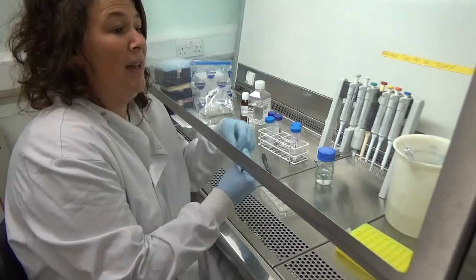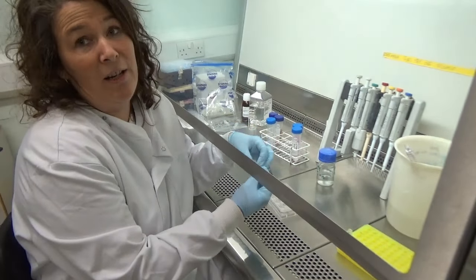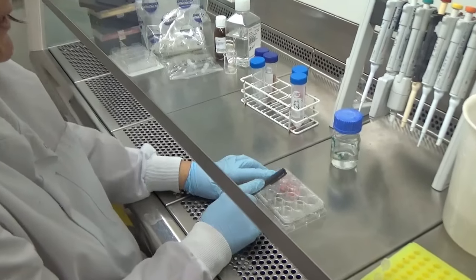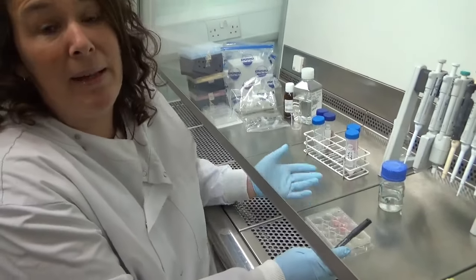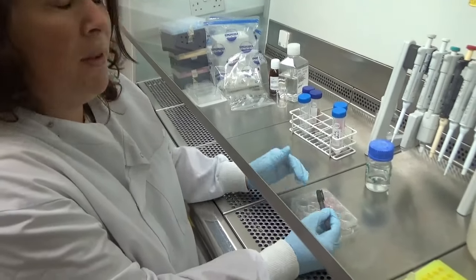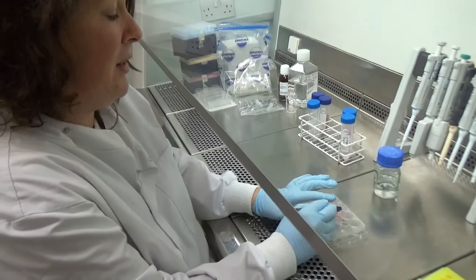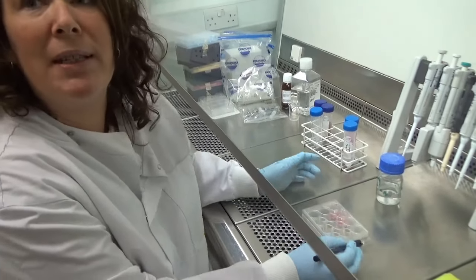So when you have a cell known as a myofibroblast consistently present, it lays down extracellular matrix, which is involved in the scarring process. Here I'm making contraction gels, and I'm treating the cells known as fibroblasts with TGF-beta. When treating them with TGF-beta, they become these myofibroblasts that I spoke about earlier that are involved in fibrosis. So I'm looking at putting them on these collagen gels and looking at the contraction that results from these myofibroblasts being present. The next stage then is to silence the receptor that I think is involved in fibrosis and see whether it reduces this contraction.